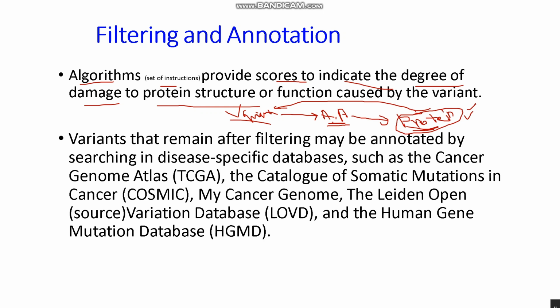If the damage is high, the score is high. Okay, the Phred score is high. The Phred score is given by using bioinformatics tools.